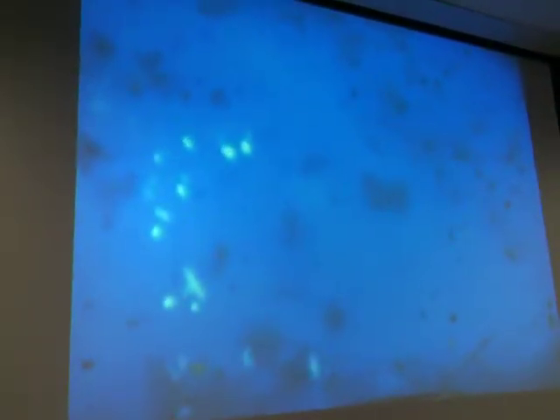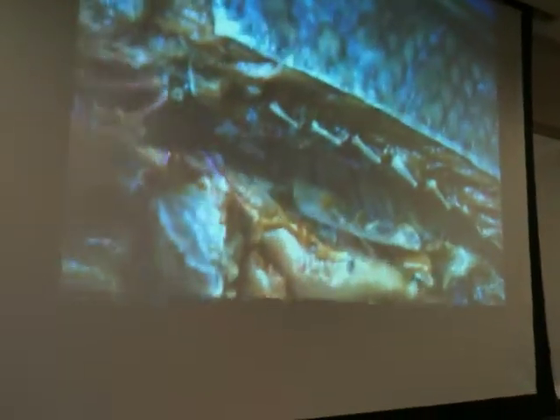Okay. Try to be careful when you're dissecting these things. I know you had to get through a lot of muscle and the rib cage and all that stuff. But we're going to be using your dissected fish for the practical. So if you mutilate them, then we'll have a fun time trying to do ID things on the practical. So try not to mutilate it too badly.